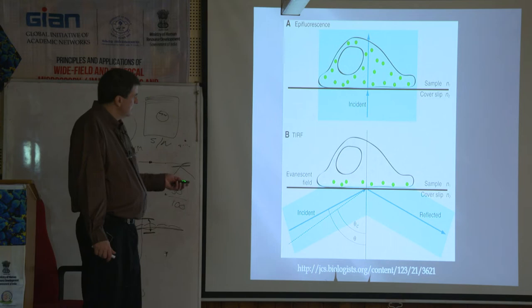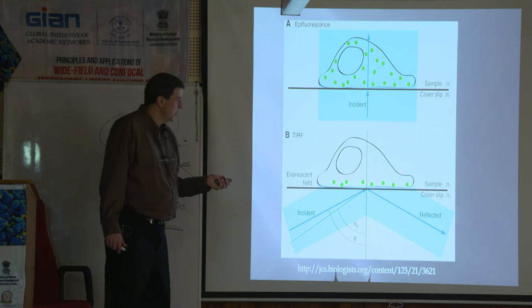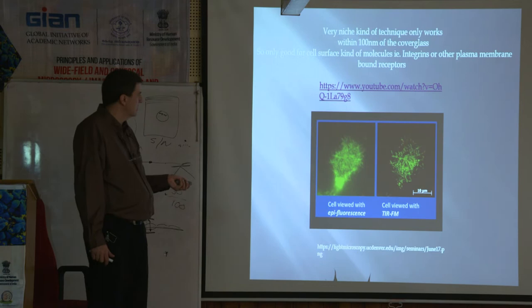So again, you have all these molecules that are tagged in a cell, but the evanescent field only travels so far from the cover slip, so the only molecules that get excited are right next to the cover slip. So it's a very close-to-the-cover-slip application. But if that's what you're after, it's amazing. Again, it's a very niche kind of instrument.